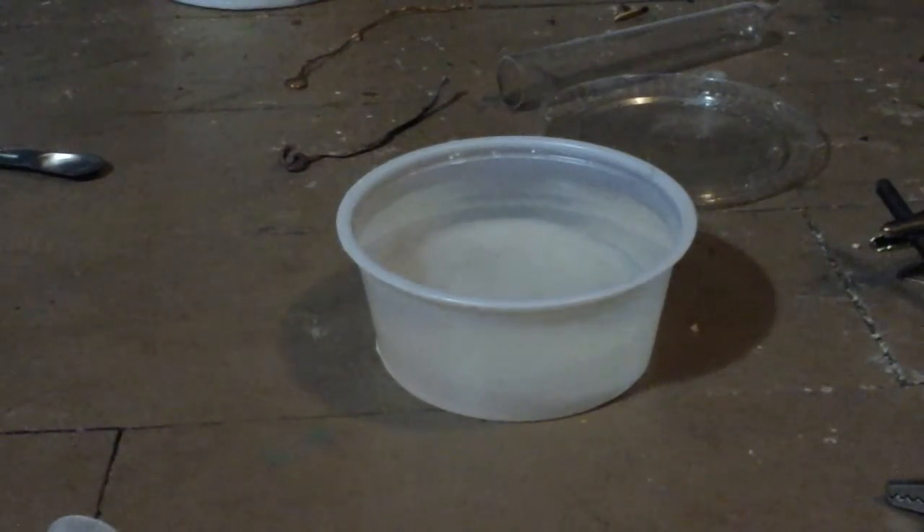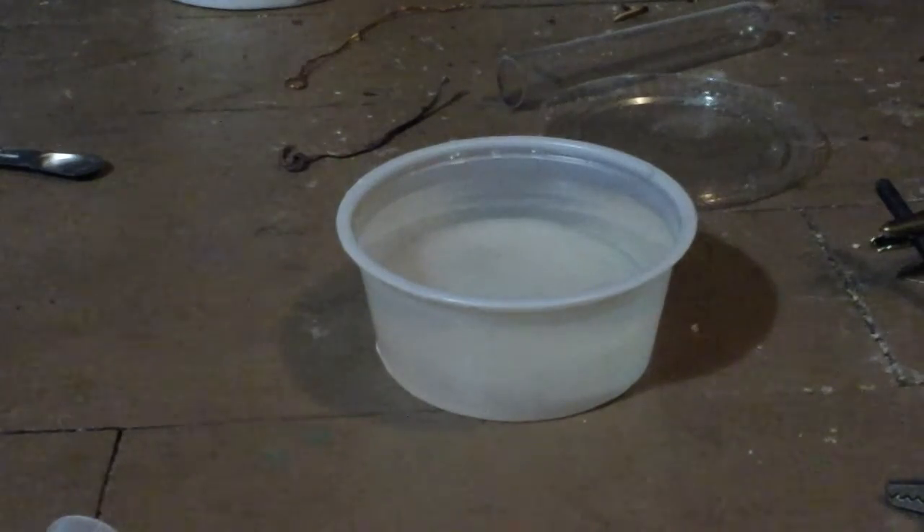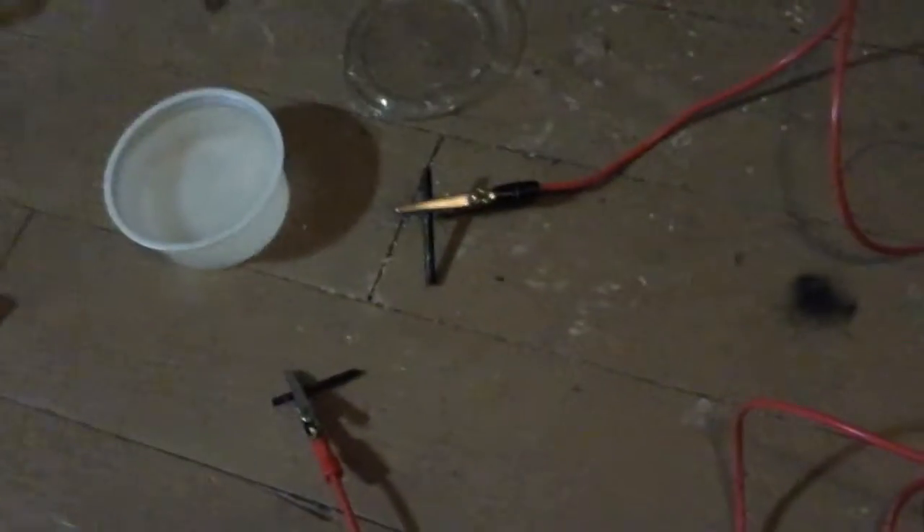What is up guys, Damon Jackson here at Noob Destroyer 1, and today I'm going to be performing electrolysis on sodium chloride solution using this, which is a lantern battery, which is 6 volts, and my long thick wires with alligator clips connected to a carbon rod.